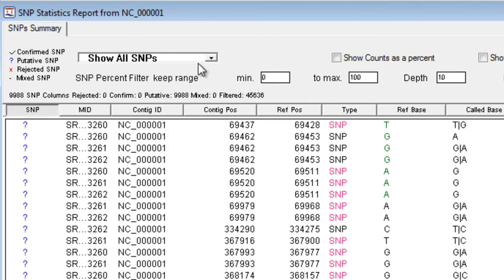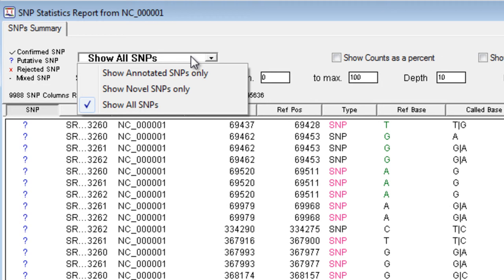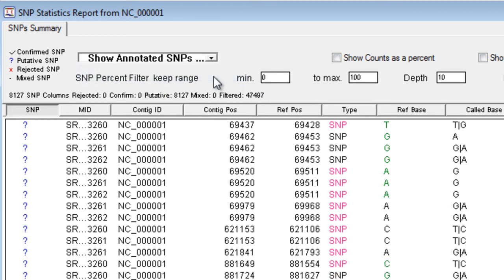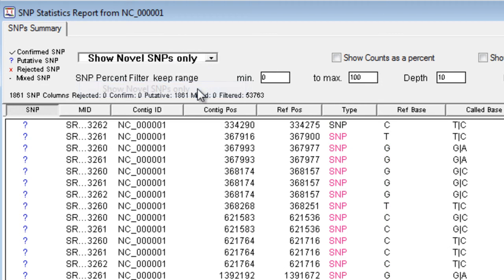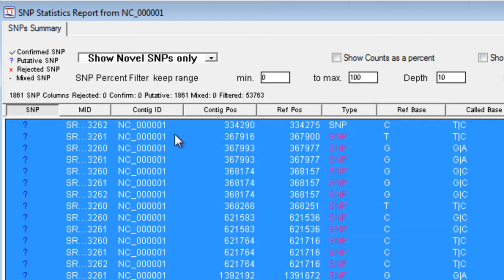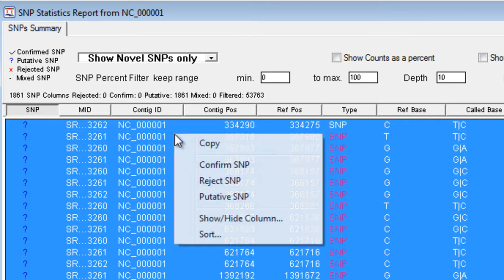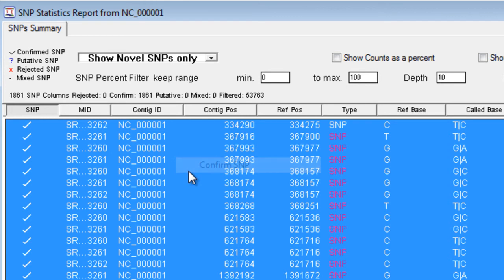Now, here we can choose to show the annotated SNPs only. These are SNPs that are already present in our SNP database. However, if we look at the novel SNPs, these are the SNPs that we are interested in adding to our novel SNP database. We can select all of these SNPs, and then choose to confirm them. We can then save these confirmed SNPs.